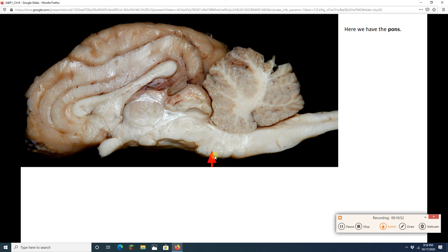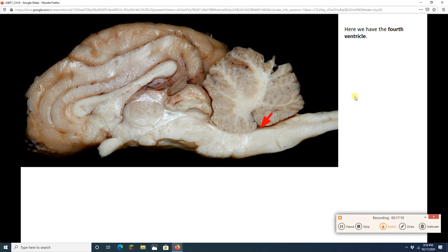Going back a little bit, we've got our pons. So we had midbrain, then pons. Then we went up to the cerebellum — we see the beautiful white matter, the arboreal white matter called the arborvitae, the white matter of the cerebellum. There's our fourth ventricle. We can also see our medulla oblongata right there and our spinal cord. And that is everything in the sheep brain.